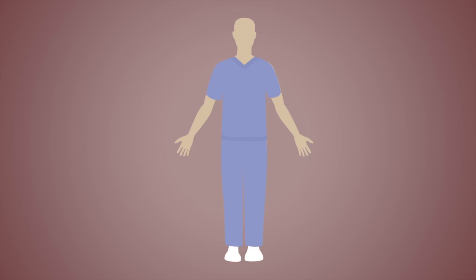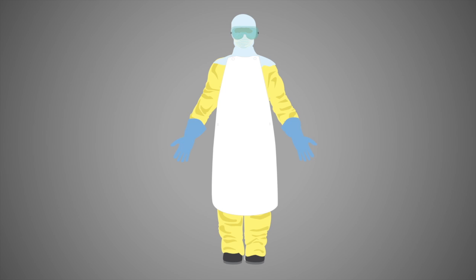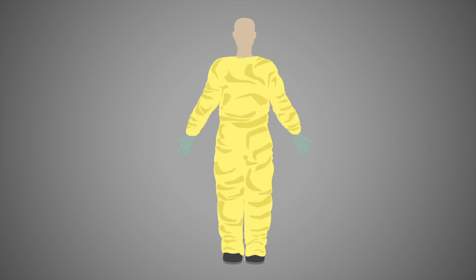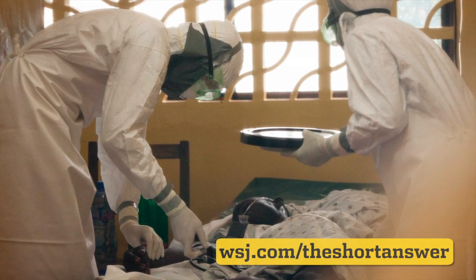The boots come off to dry, usually upside down on sticks. Then it's finally safe to leave the hot zone and enter the low-risk area. The full process requires training and then following this highly specific protocol to avoid the fate of some of West Africa's most prominent doctors who've died from Ebola.